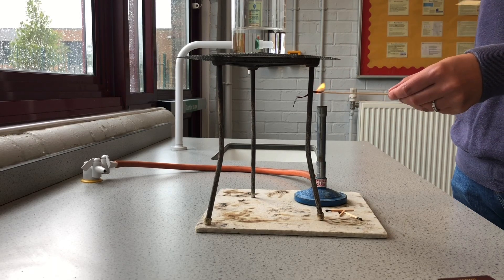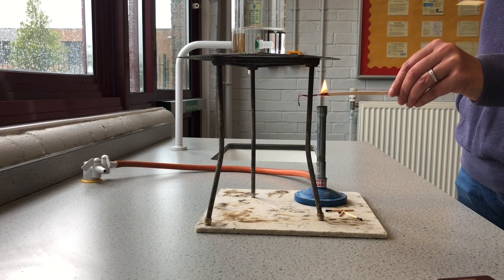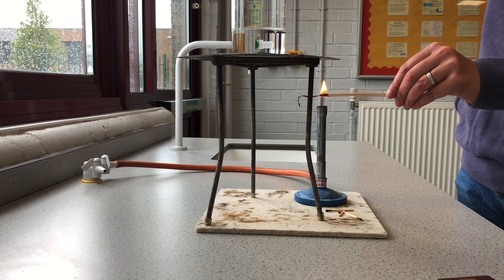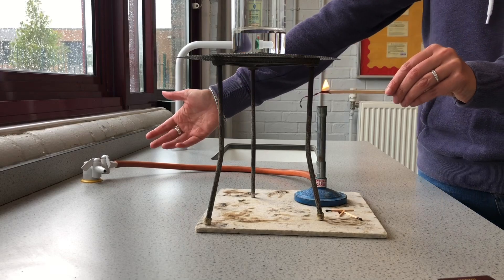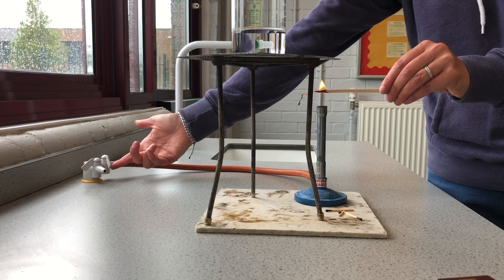This is where people start getting a bit frantic — that's not a good idea. We like to stay as calm as possible. We're going to light our Bunsen by turning on the gas tap. Hopefully you can see here — I can lift up the gas tap and it drops down, meaning it's off.